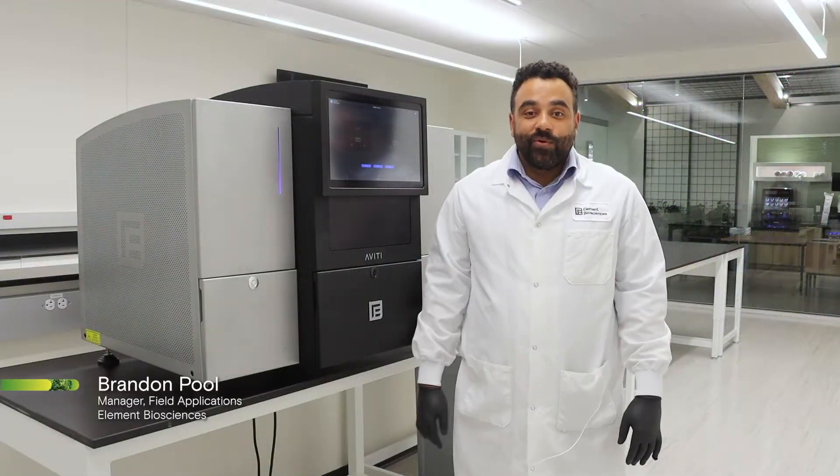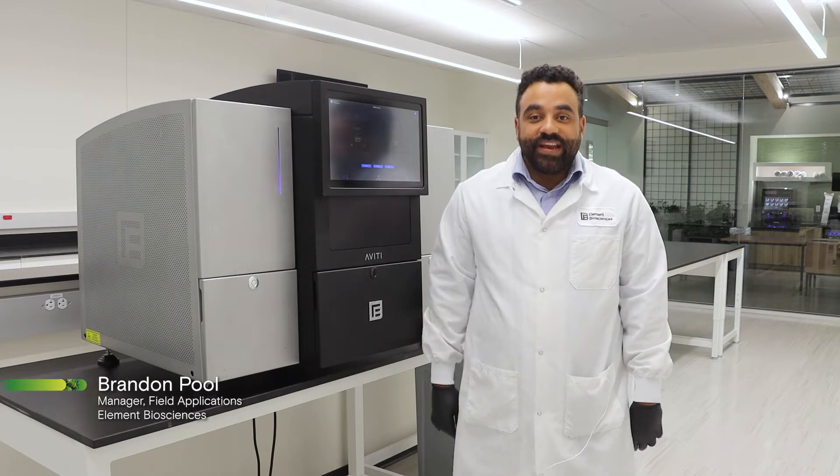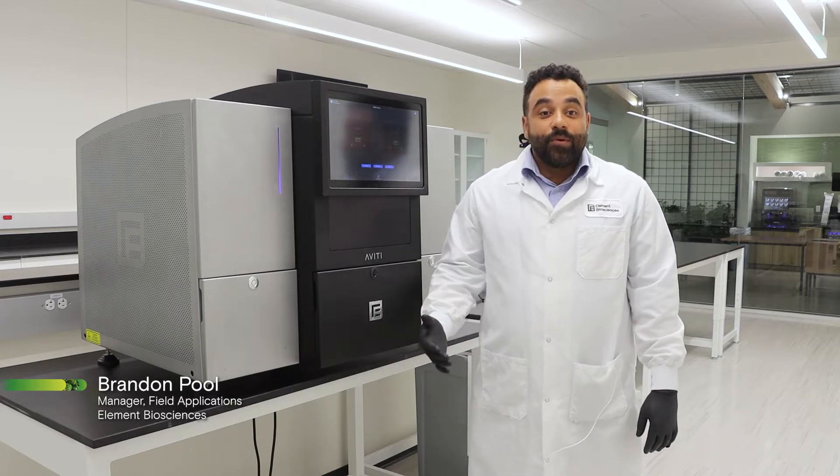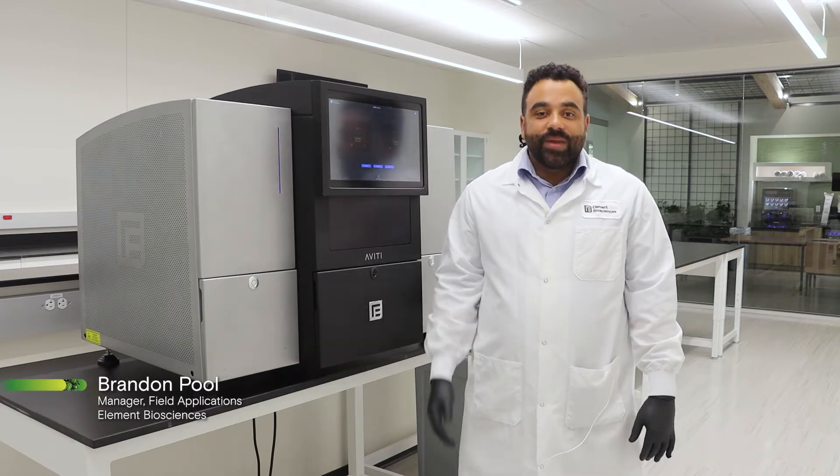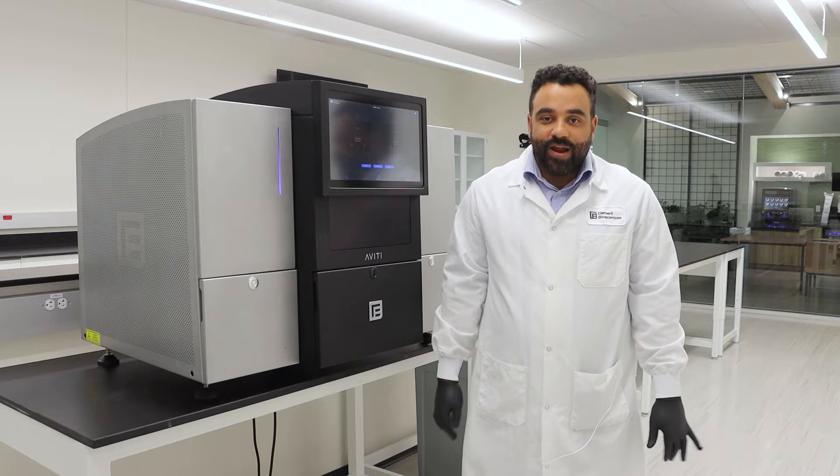Hi, my name is Brandon Poole and I'm going to give you a demonstration of the Aviti system today. This demo is naturally quick because the Aviti is extremely easy to operate.